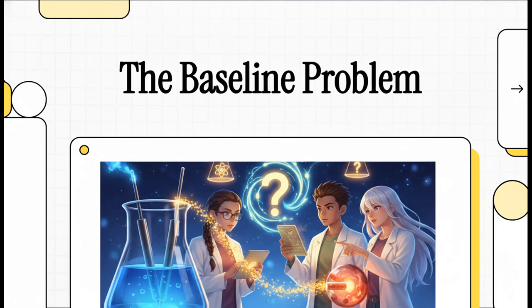Welcome back to the Explainer, everyone. Today, we're diving headfirst into the hidden electrical world of chemical reactions. And we're going to do this by walking through a truly complete cinematic experiment presented by Dr. Chem, all about the measurement of electrode potential.